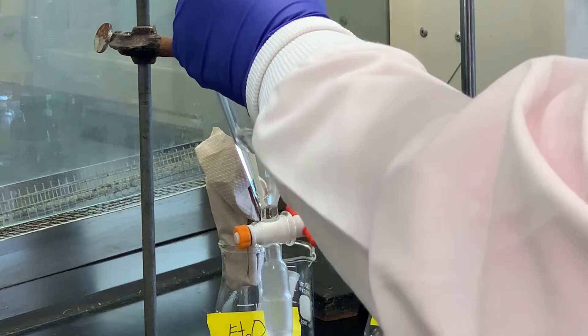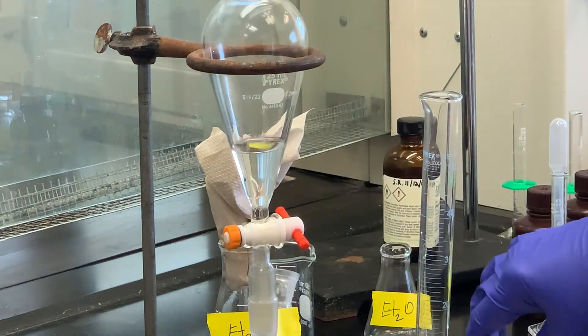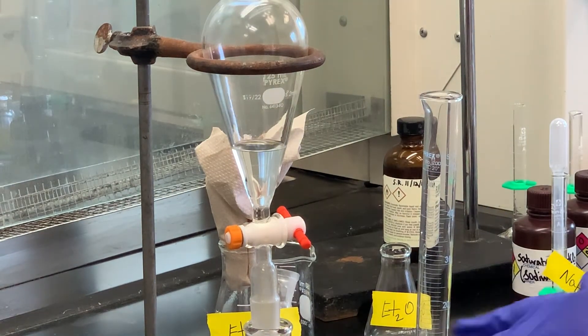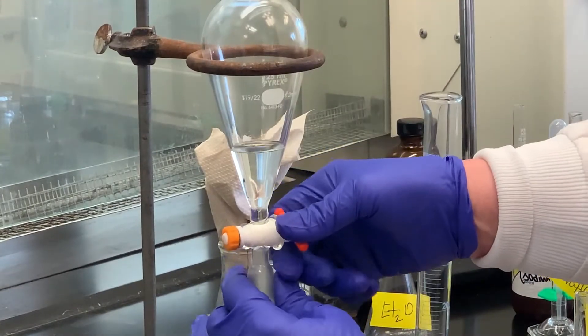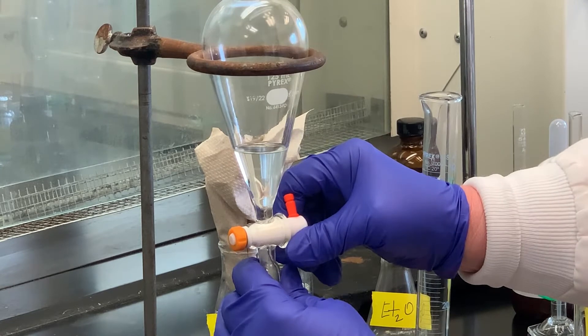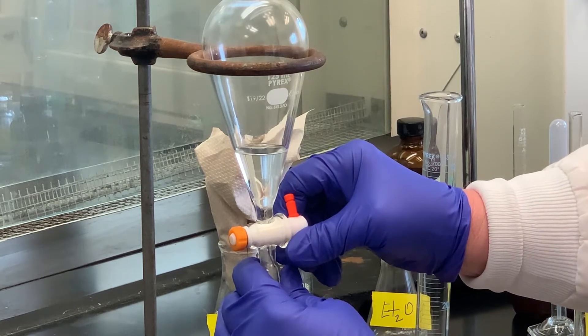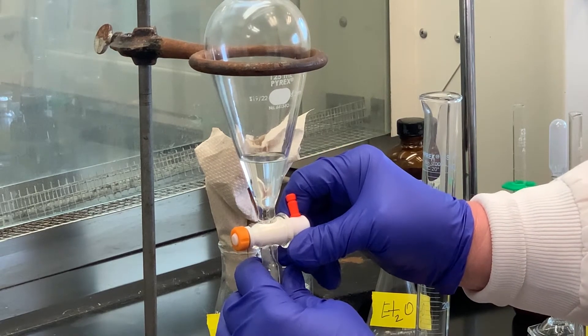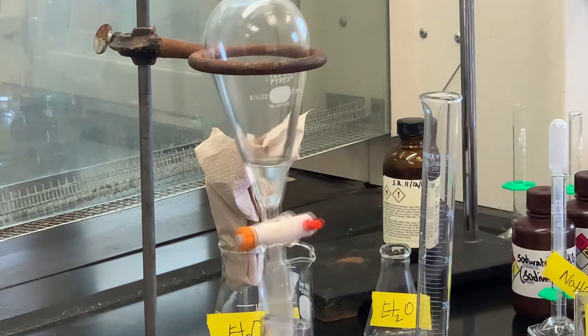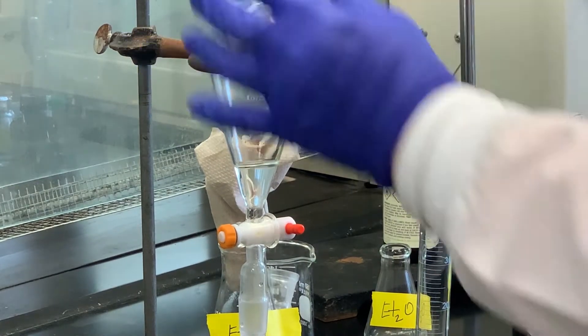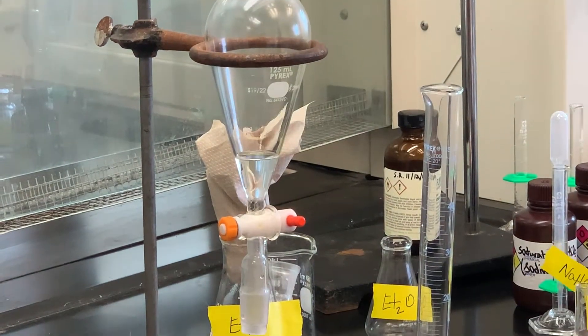So if the aqueous was the bottom layer before, then it's going to be the bottom layer now. Nothing's changed. So once I drain off the aqueous, I'm done with the aqueous layer. So I'm going to open this up and I'm going to drain this one a little slow because it is hard to see where that line is. And this is our aqueous. I'm done with that. So what we have in here now is the organic layer that contains our ketone, which is what we made from the oxidation.